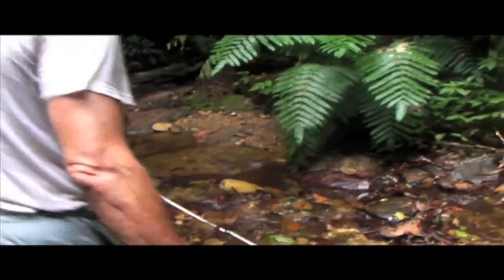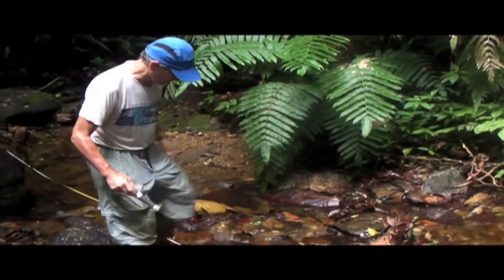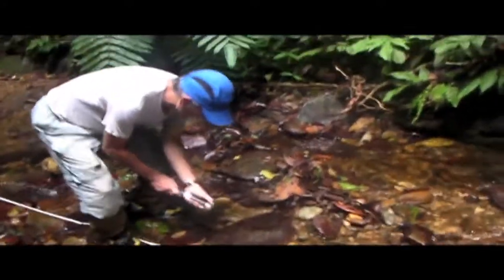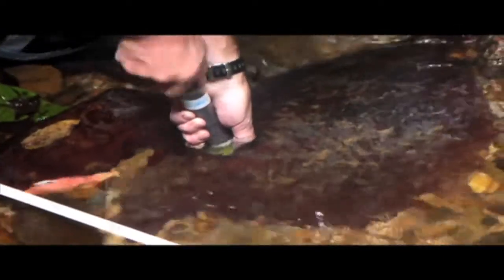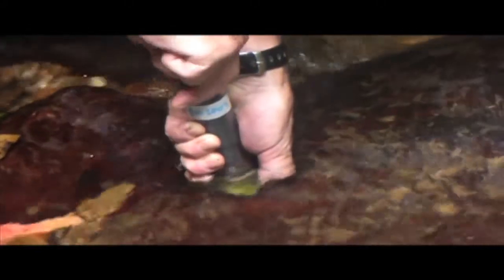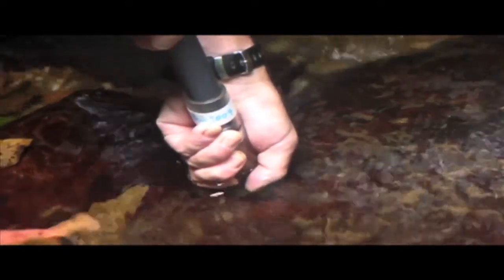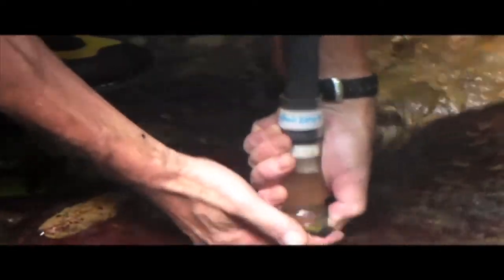Okay, now I'll demonstrate. Okay, so I put the brush so that it's flush with the end point, and I'm going to put my finger over this hole, and I'll press this against the surface of the rock and press down and turn clockwise 5 times, counterclockwise 5 times. Take my finger off the hole, pull up the plunger, put my finger back on the hole, and then lift it up.